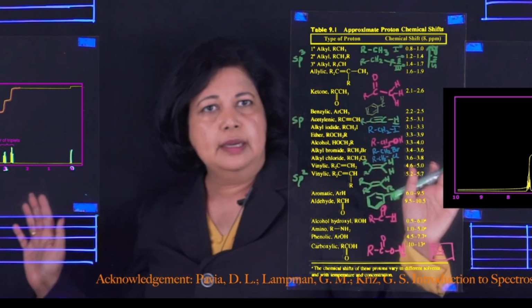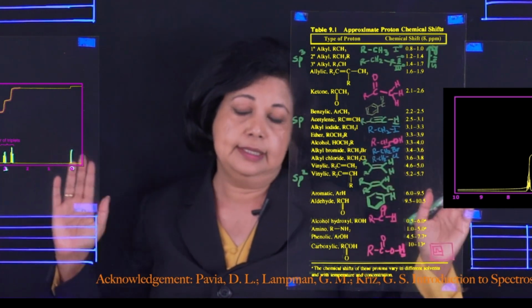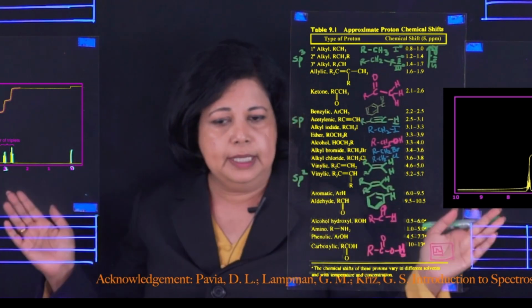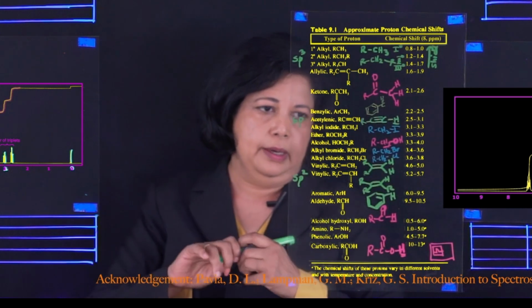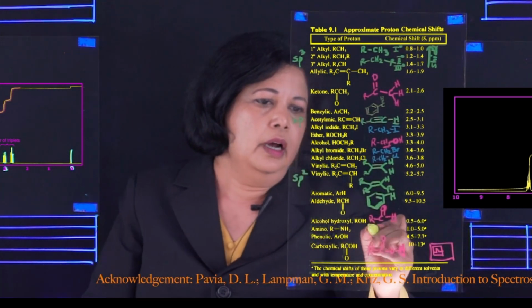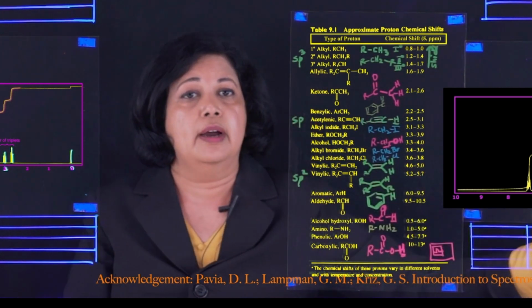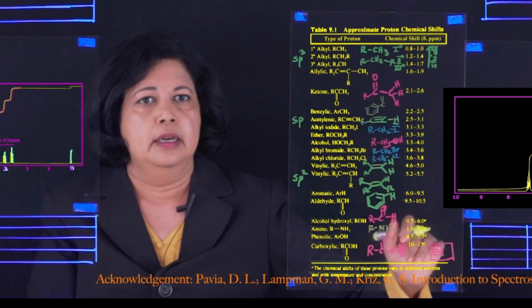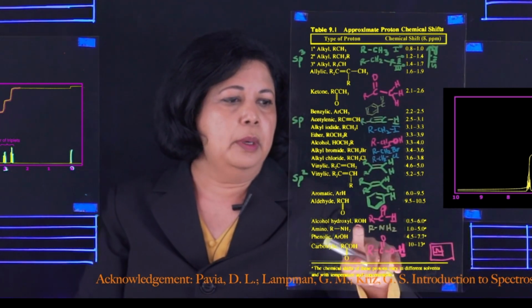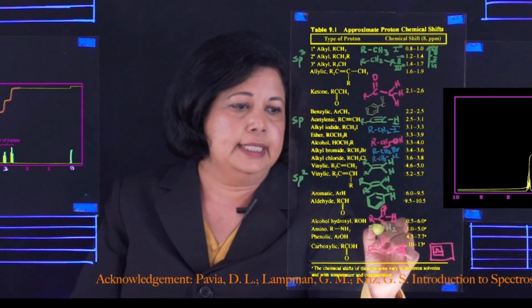Now, there are two types of protons in an NMR which have a very wide range for the delta, and they can appear anywhere, and typically they are broad peaks, and we saw some of them earlier. So if you have an amine, RNH2, it's anywhere between 1 and 5. And if you have an OH, it can be anywhere between 0.5 and 6.